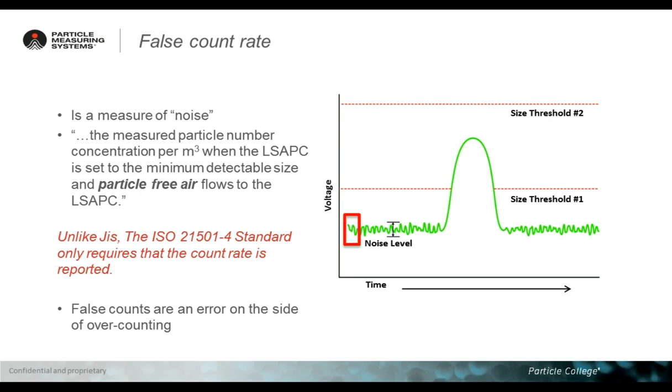And as well, this test can help you understand if the particle counter optical cell is clean, is not contaminated, and is not introducing particles to your analysis.